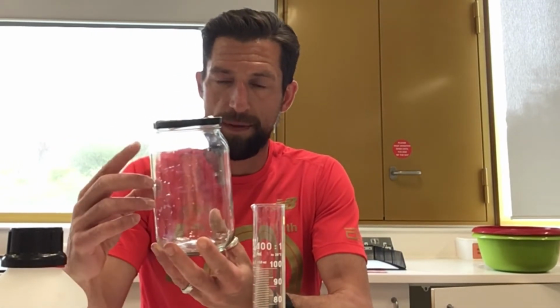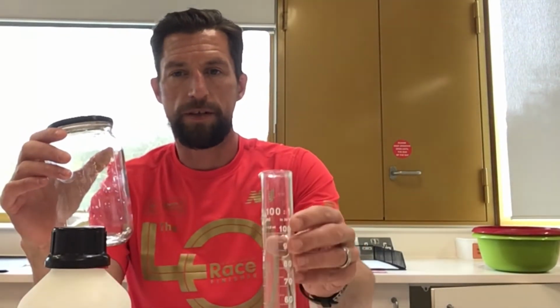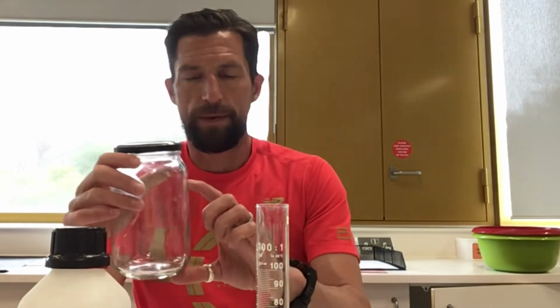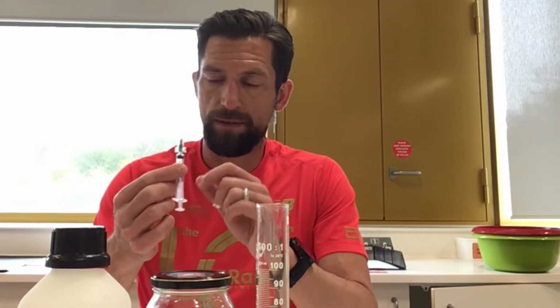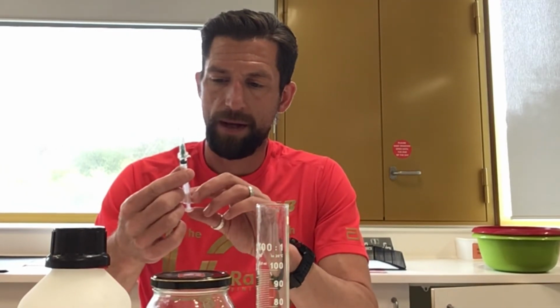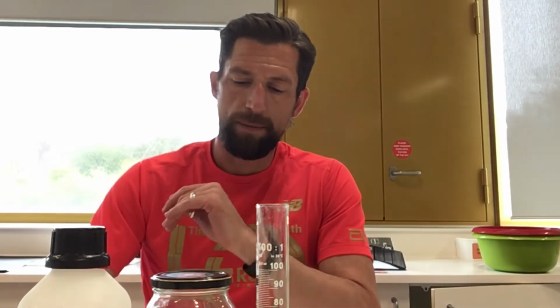Now this is the jar that I'm going to use for my wet specimen. I'm going to fill this with the same 10% formalin, which I'm going to make by diluting the formaldehyde with water using my measuring cylinder. So I'm going to fill it with the same solution, and once I've injected the snake fully, making sure that I don't inject it with any air, and making sure that the syringe doesn't have any air in when I inject it, so it doesn't float, I'm going to put it in the jar, and I'm going to leave it in there for about 3 to 4 weeks.